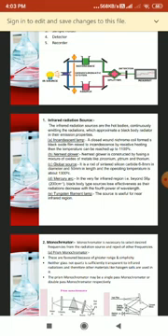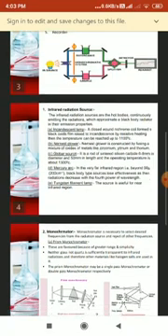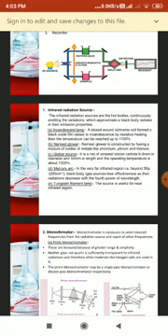The infrared radiation sources are hot bodies continuously emitting radiations which approximate a black body radiator in their emission properties, in which the first radiation source is the incandescent lamp. A closed wound nichrome coil can be raised to incandescence by resistive heating. A black oxide film formed on the coil gives acceptable emissivity. In this, the temperature can reach up to 1100 degrees Celsius.